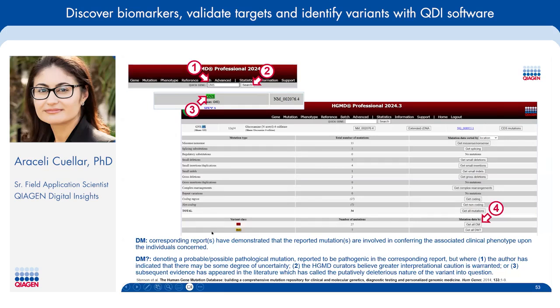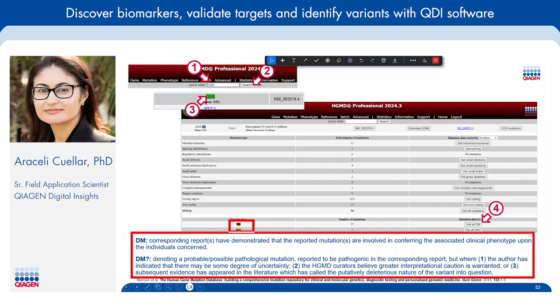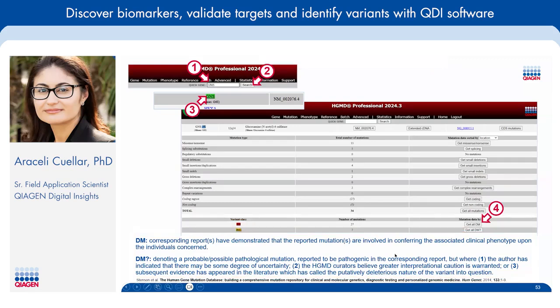For those of you that are new and may be confused as to what these abbreviations are, this slide does include the original definitions that the authors gave in the original paper, so you can always refer to that for insight.